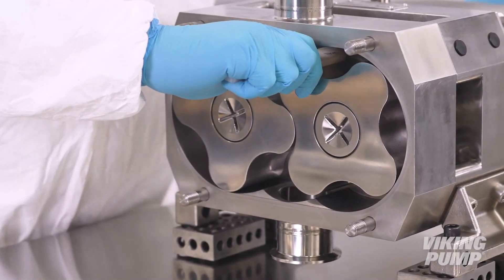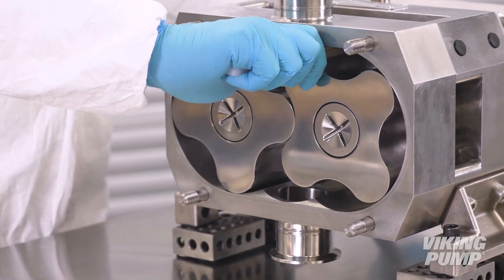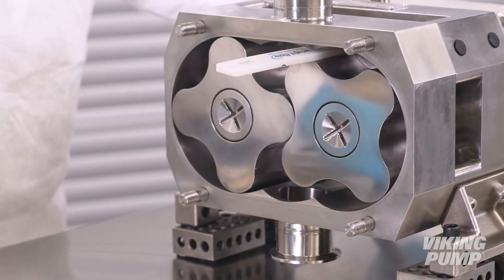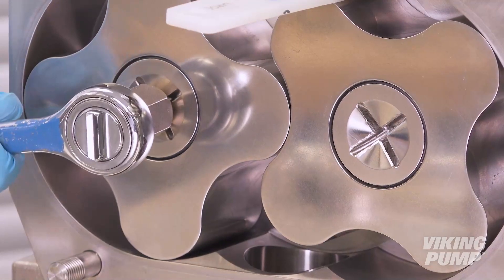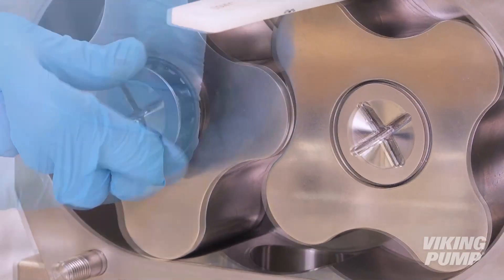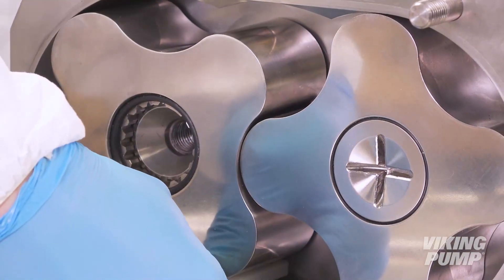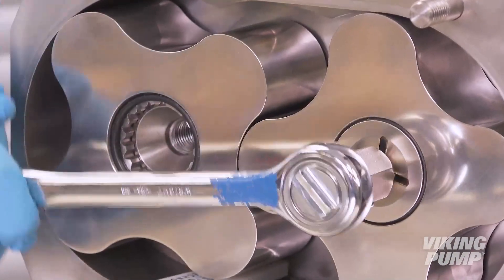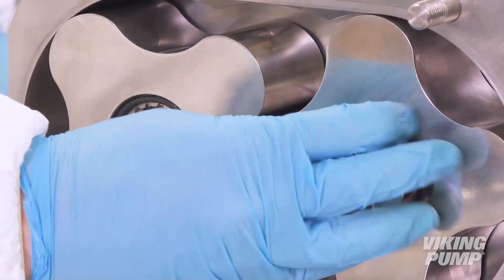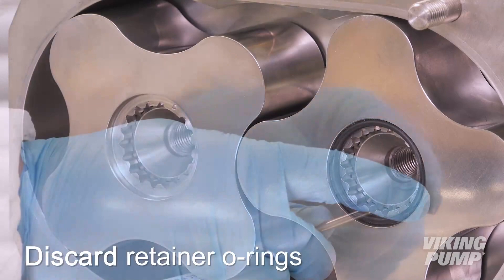Next, to prevent the rotors from turning, insert the rotor locking tool provided with the pump, or a dowel made of plastic or other non-metallic material, between the pump body and rotor. Using the provided cross socket and a ratchet, loosen and remove the rotor retainers. Remove and discard the retainer o-rings.